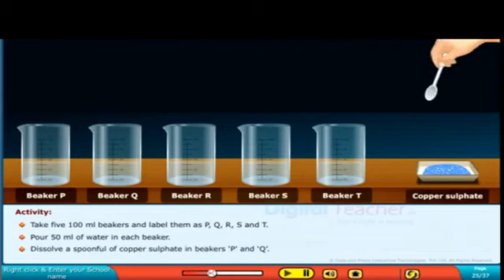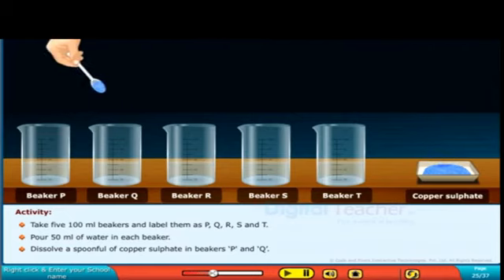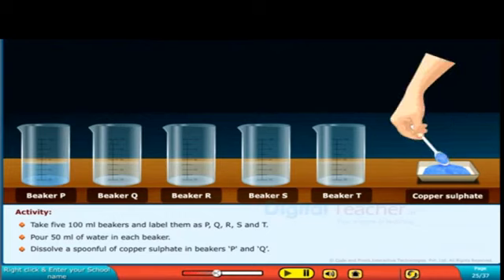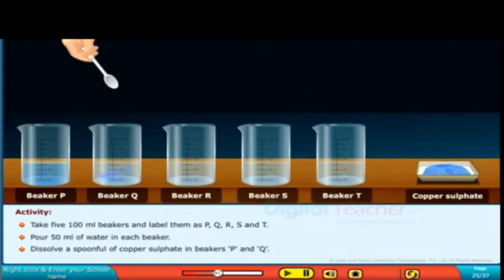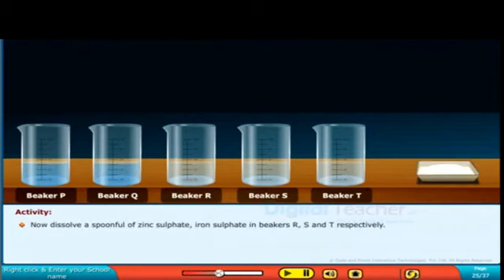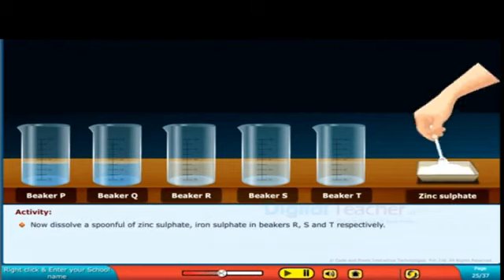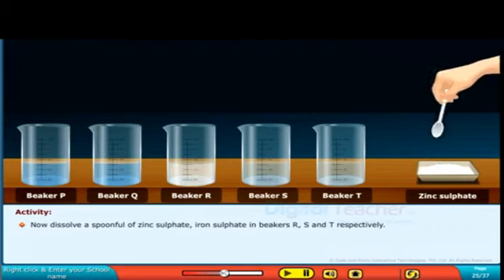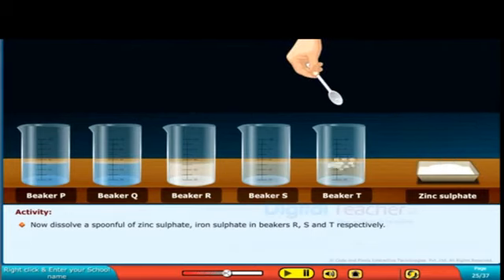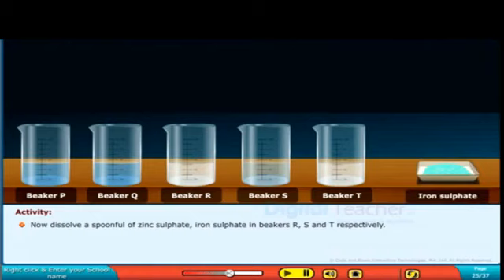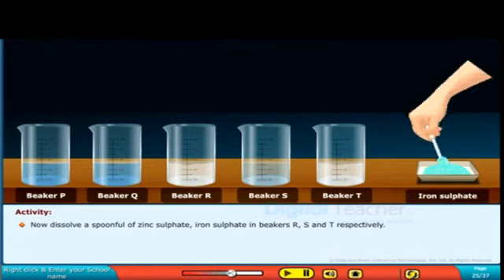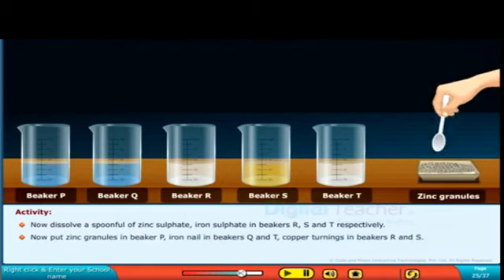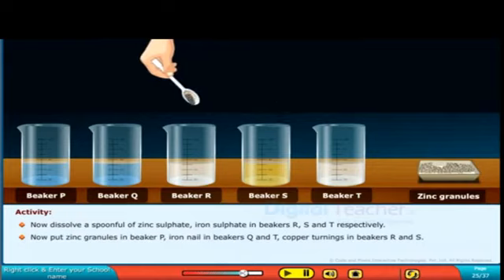Next, we need to prepare copper sulphate solution in beakers P and Q. Then we prepare zinc sulphate solution in beakers R and T by adding zinc sulphate powder and dissolving it. Then we make iron sulphate solution in beaker S by adding iron sulphate.